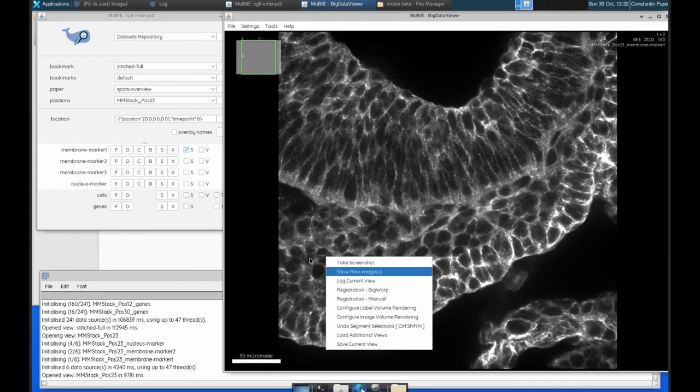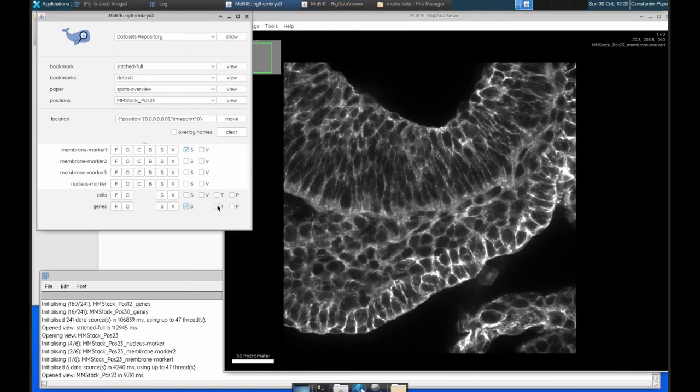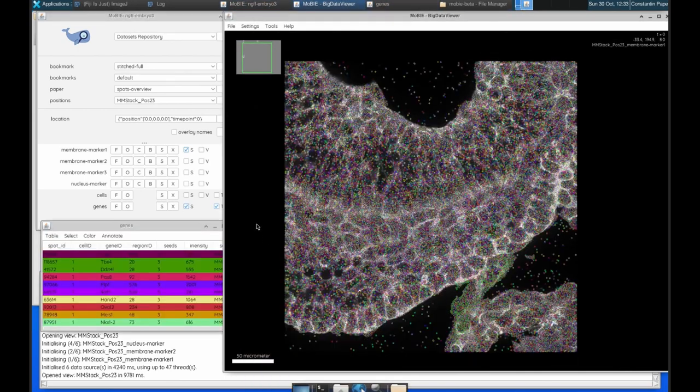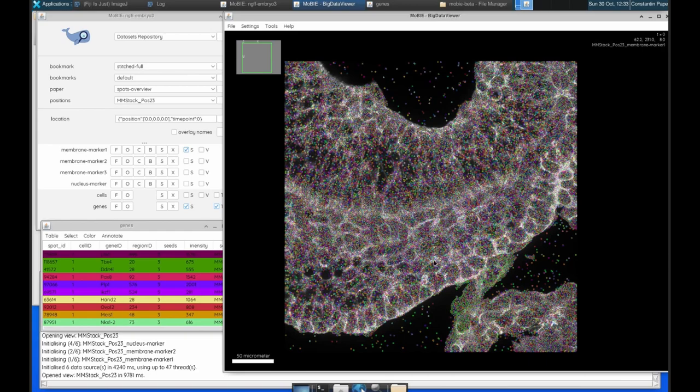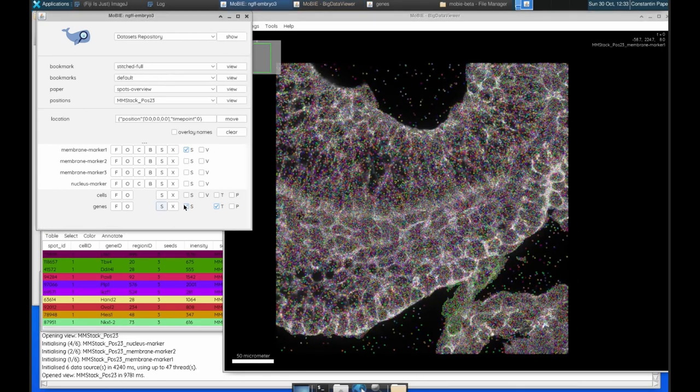And we have that same data. We have this membrane marker that we were seeing before. If I turn on the genes, we have those same spots that we were looking at before with all of the gene IDs and so on.